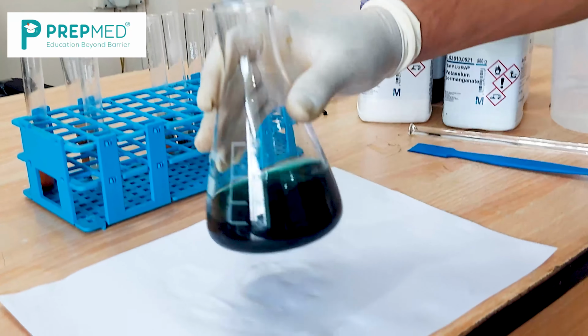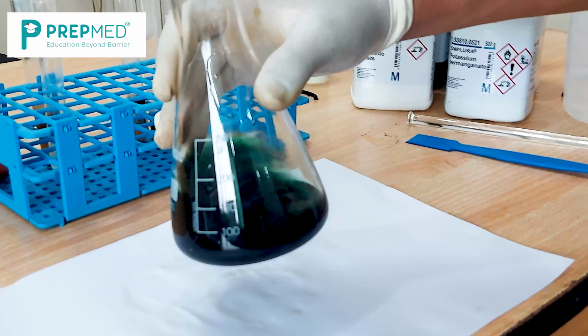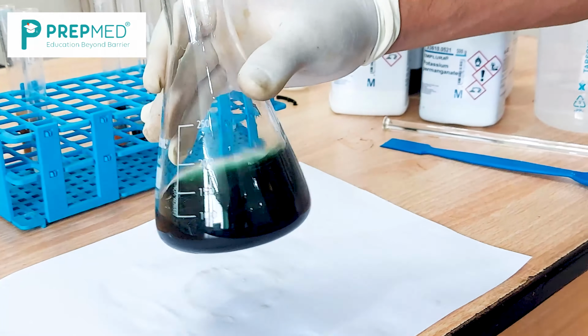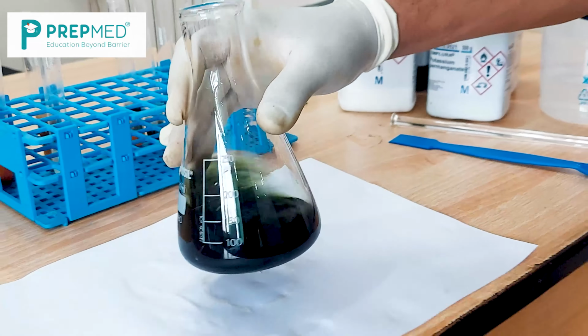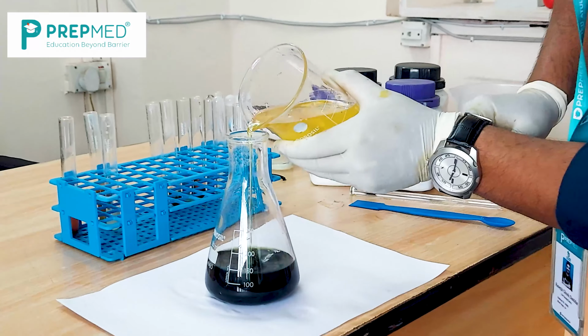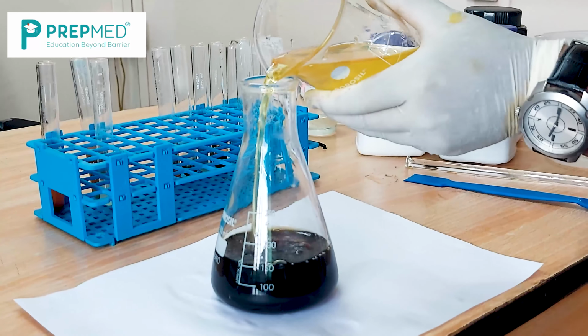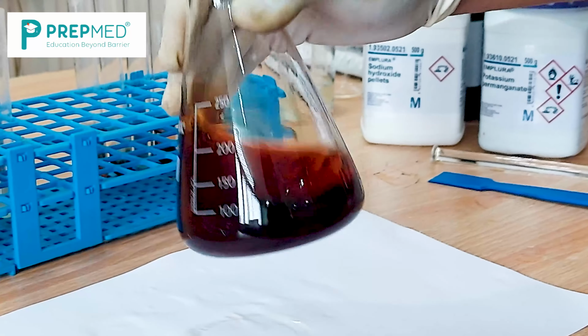You can see the color of the solution has turned green. So this is manganese in +6 oxidation state. Now slowly the green color is getting faded. If you add more of the glucose solution, the solution has turned red.